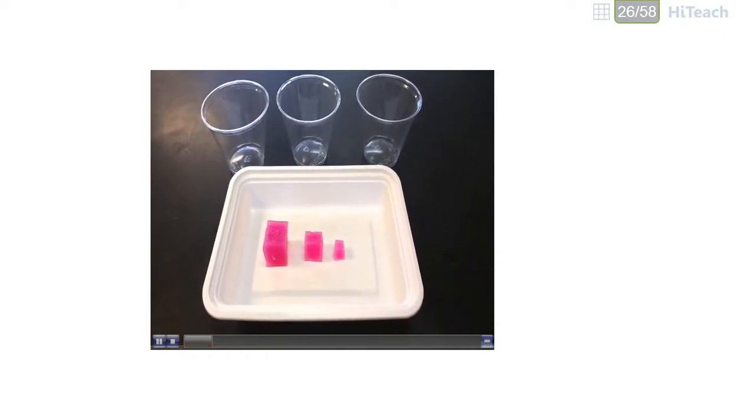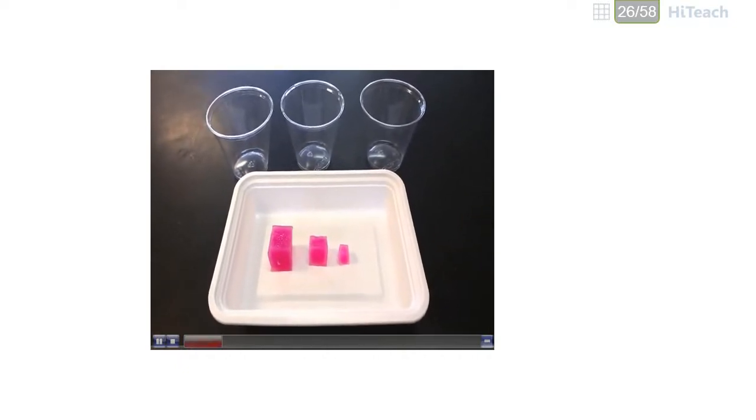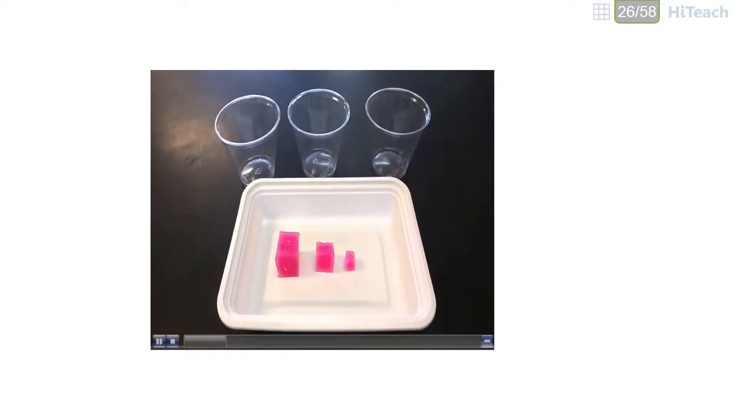Basically, you can cut the cubes into three sizes. The larger one is a 2.5 centimeter cube. The middle one is a 1.5 centimeter cube. And the smaller one is about a centimeter-size cube.